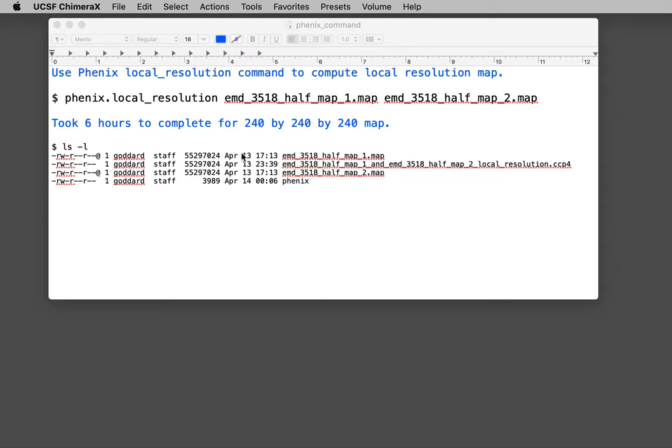Here's the Phenix local resolution command. It takes two masked half maps, maps computed with half of the particles. This took six hours to run for this 3 angstrom resolution map that has 240 grid points on a side.